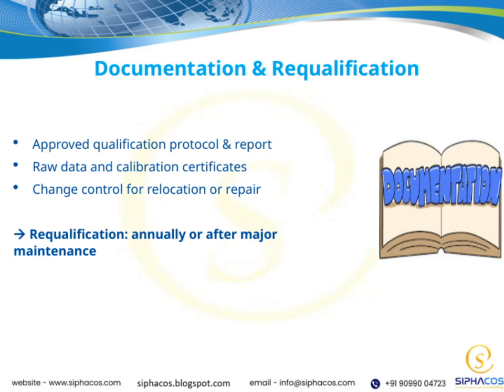This ensures that modifications are documented, evaluated, and approved before implementation. Requalification is an ongoing process. It's typically performed annually or after major maintenance. This helps us confirm that everything remains in compliance and continues to operate as intended. Overall, these documentation and requalification practices are vital for maintaining regulatory compliance and ensuring the reliability of our systems.